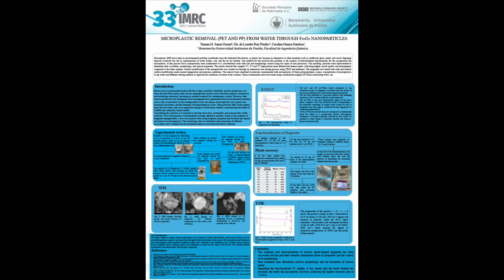1268 cm⁻¹. This broad band does not correspond to a fundamental mode, but rather to a second-order process, 2-magnon scattering or overtones typically observed in iron oxides. Its presence is often related to structural disorder and electron-phonon interactions.